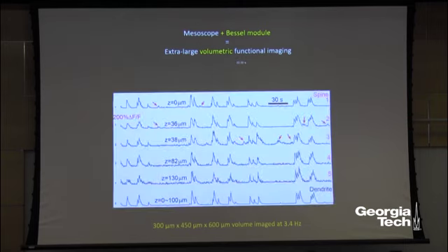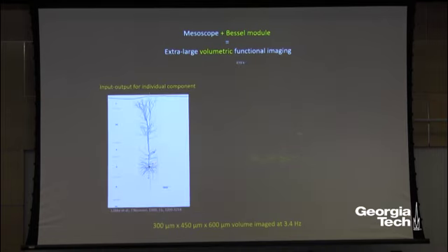But for many of them, you will also see local synaptic input that is not synchronized with the global events. And those are what people are very interested in: what are the synaptic inputs being received here. With this method, we finally have a way to answer this question: what is the input-output relationship of a single neuron, which requires interrogating all the spines or synaptic inputs onto the single cell, which is often in 3 dimensions. With Bessel beam, we can now interrogate this in real time in the context of calcium imaging, which is, of course, slower than the membrane potential. But we will get to the membrane potential part later.